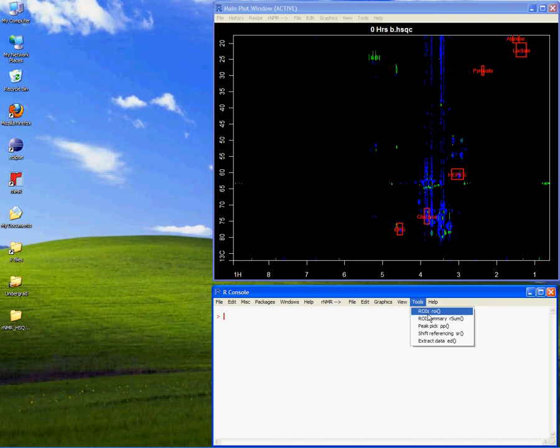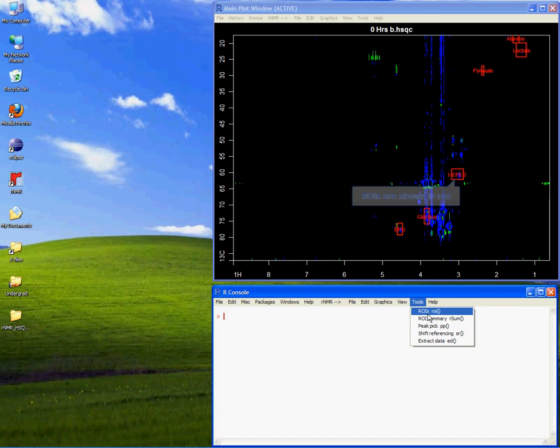For demonstration purposes, I'll use an example dataset with an ROI table already in place. This example is a set of two-dimensional HSQCs taken from a study of red blood cell metabolism, available at the RNMR homepage.